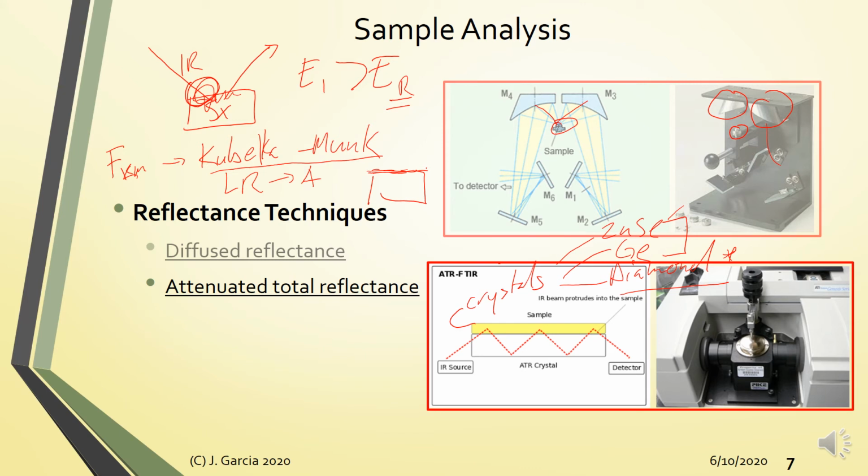Now, you can analyze solids and liquids using ATR. Alright, kung liquids yan, you just drop some of your sample. Of course, wala pa rin water, kasi masyadong overwhelming yung signal ng water. Then you just run your IR.